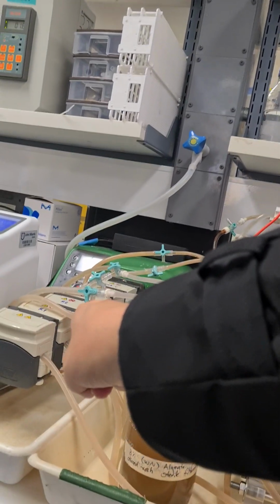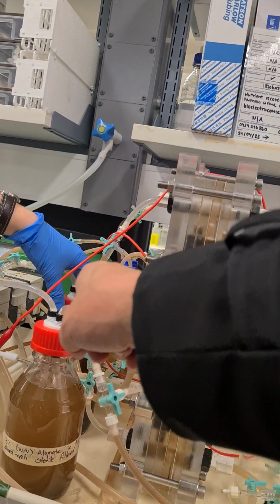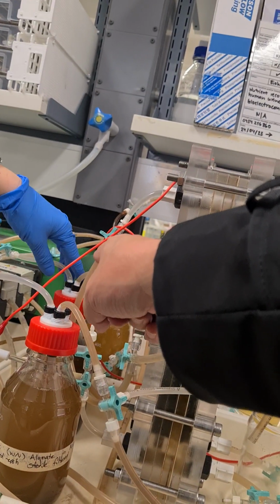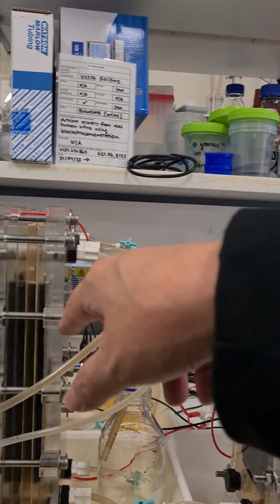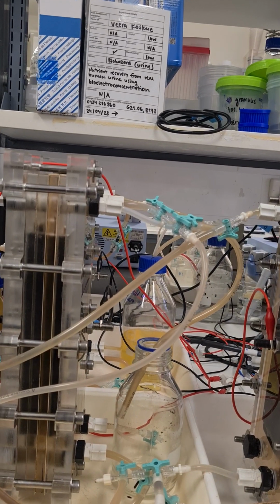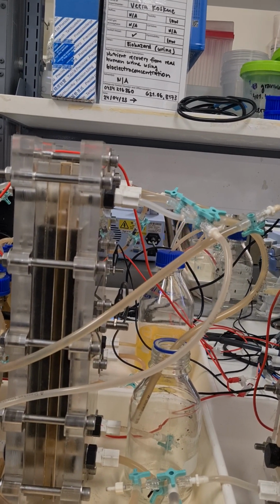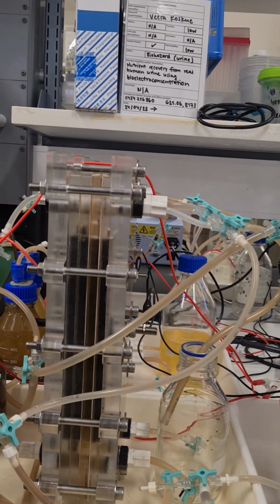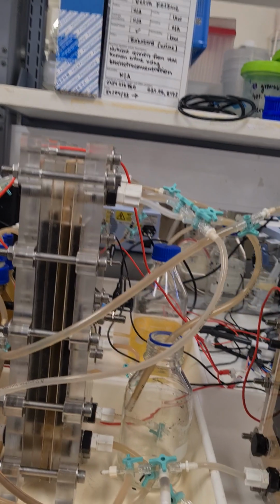So this is now the anode circulation loop. Yes, I actually have these two hydraulically combined at the moment for the inoculation. I will then separate them later. But the anolyte will circulate over this bottle, and the catholyte over this one, similarly to that one, although it's anode and cathode.